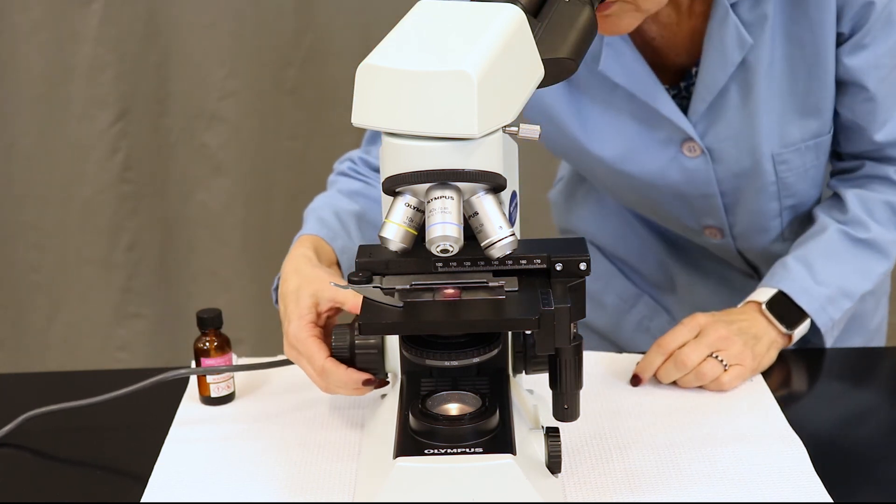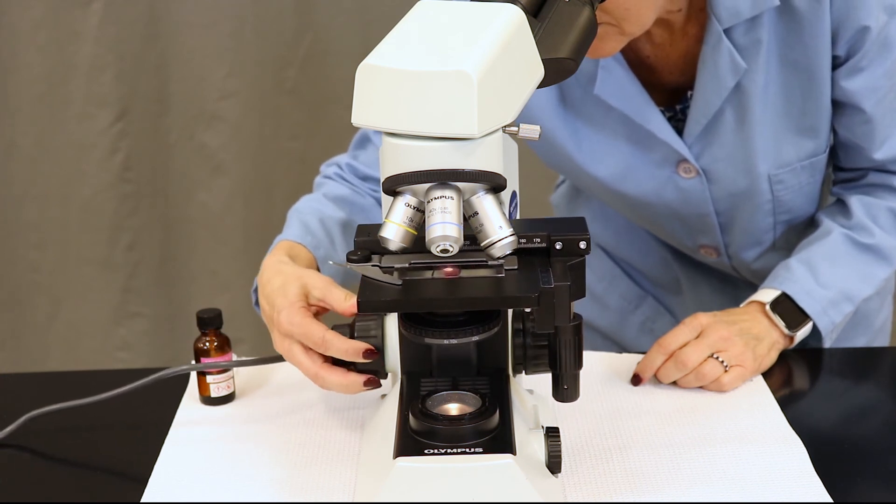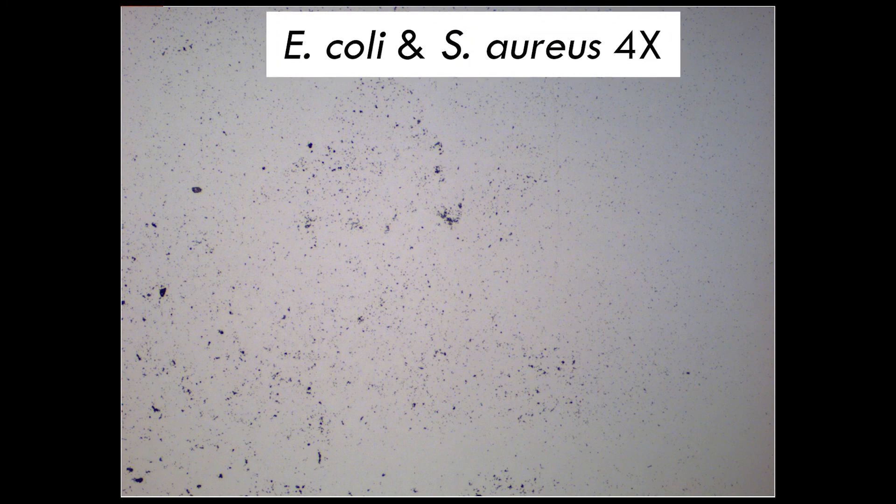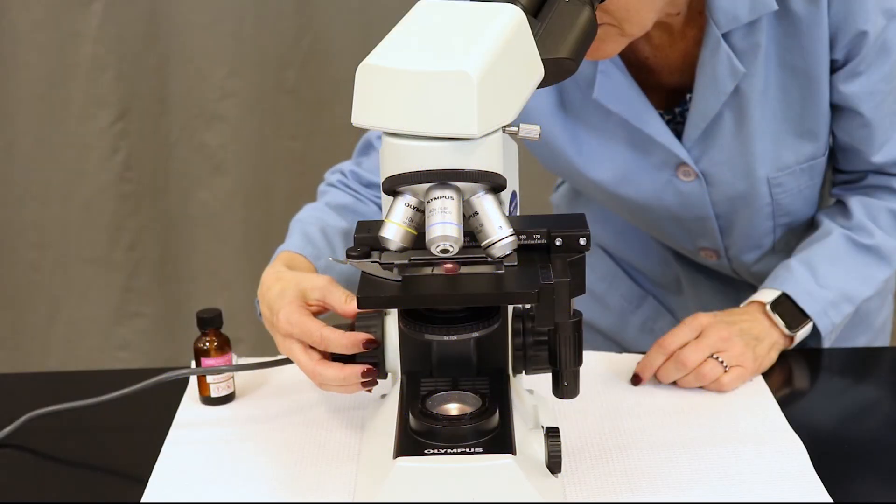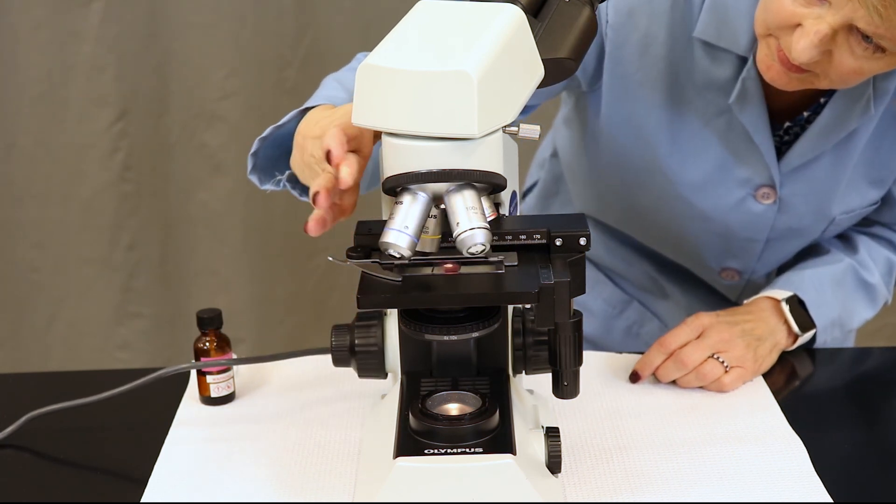Use the coarse adjustment knob or the large knob on the side of the scope to raise the stage. Once you begin to see color, usually either pink or purple in our class, you're ready to move up to the next objective.